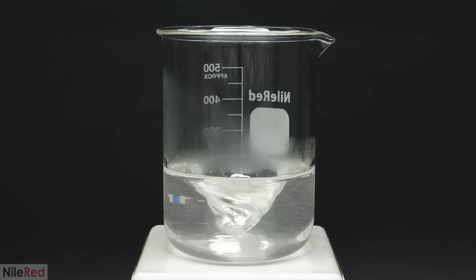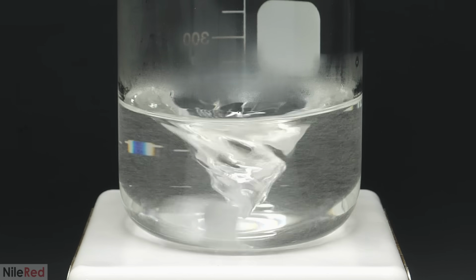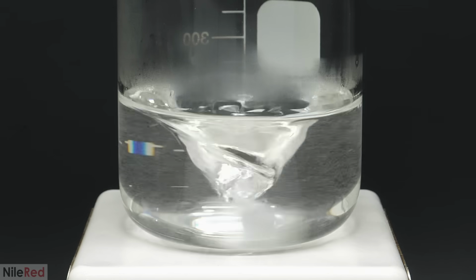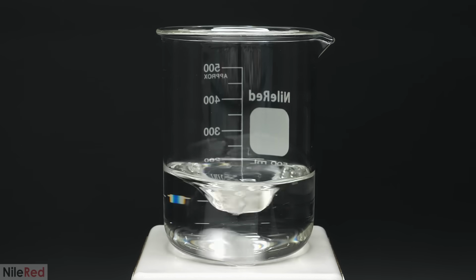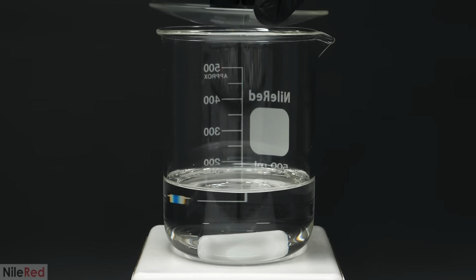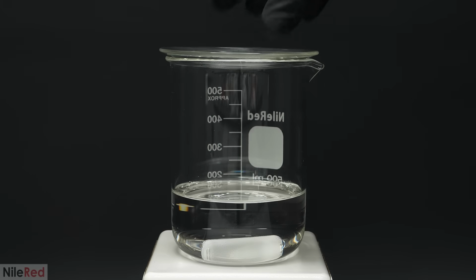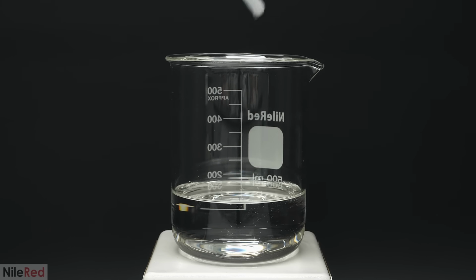If I'd used regular water instead of ice, it probably would have violently boiled and splashed, which wouldn't have been ideal. But anyway, when it looked like it was all mixed, I turned off the stirring and let it cool down to room temperature. About 30 minutes later, it was good to go, and I pulled out the stir bar.